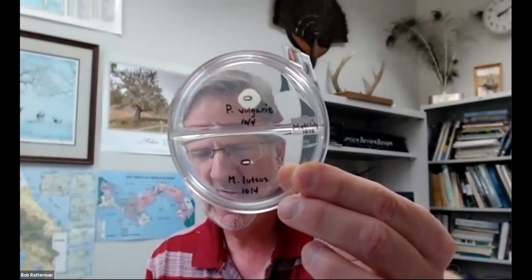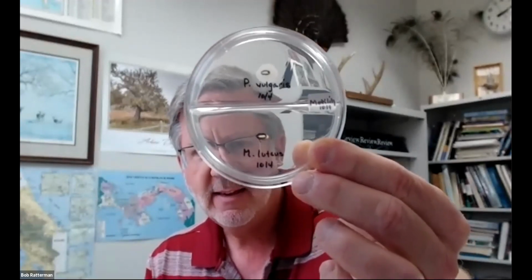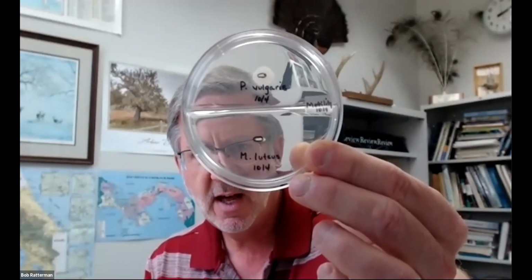And you can see, of course, that the Proteus vulgaris has moved out from that little center circle where she had initially inoculated, while the Micrococcus luteus there at the bottom has not moved appreciably out of the initial inoculation line. So obviously, Proteus vulgaris has motility thanks to the presence of flagella, while Micrococcus luteus is non-motile, does not have flagella. So the students basically recreated what Deb had done using this special motility media. And we'll probably be using this again once we get your unknown and start doing some tests on it.